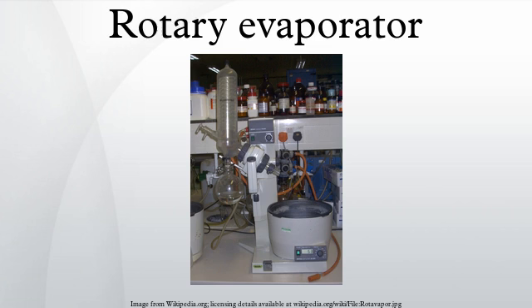A rotary evaporator is a device used in chemical laboratories for the efficient and gentle removal of solvents from samples by evaporation. When referenced in the chemistry research literature, description of the use of this technique and equipment may include the phrase rotary evaporator, though use is often rather signaled by other language. Rotary evaporators are also used in molecular cooking for the preparation of distillates and extracts.